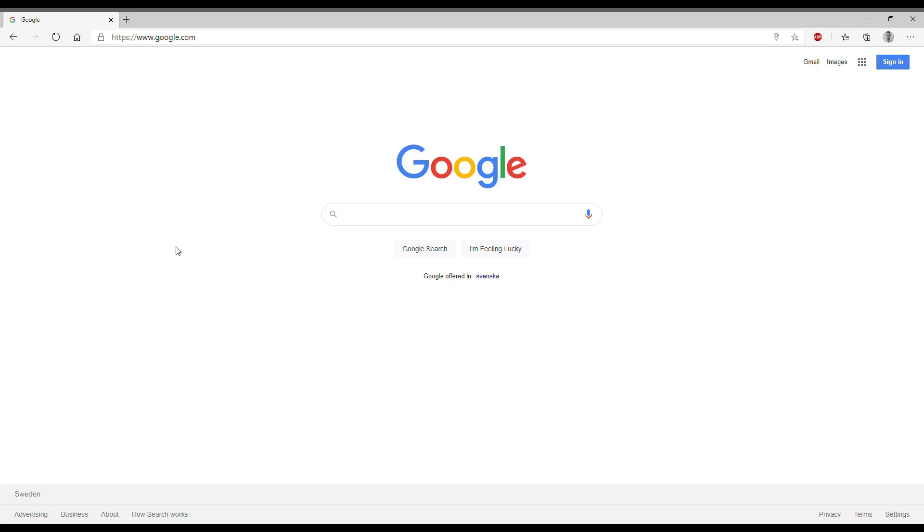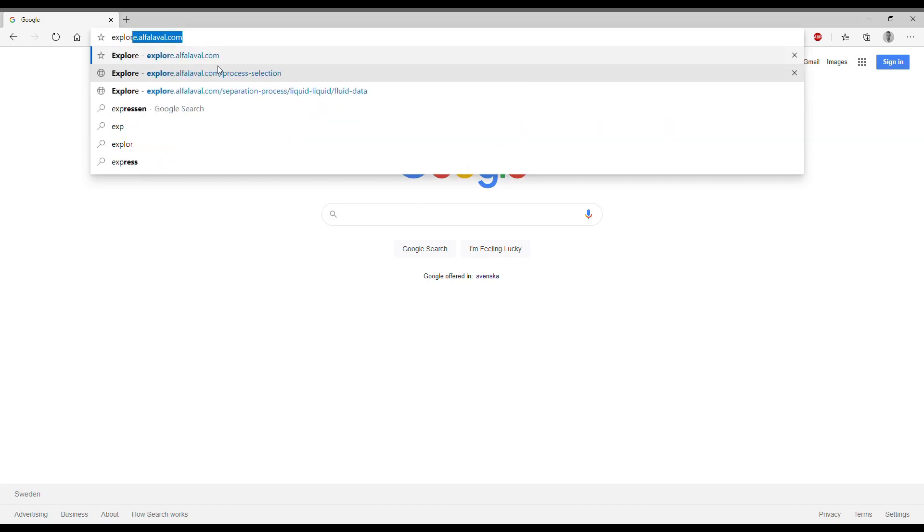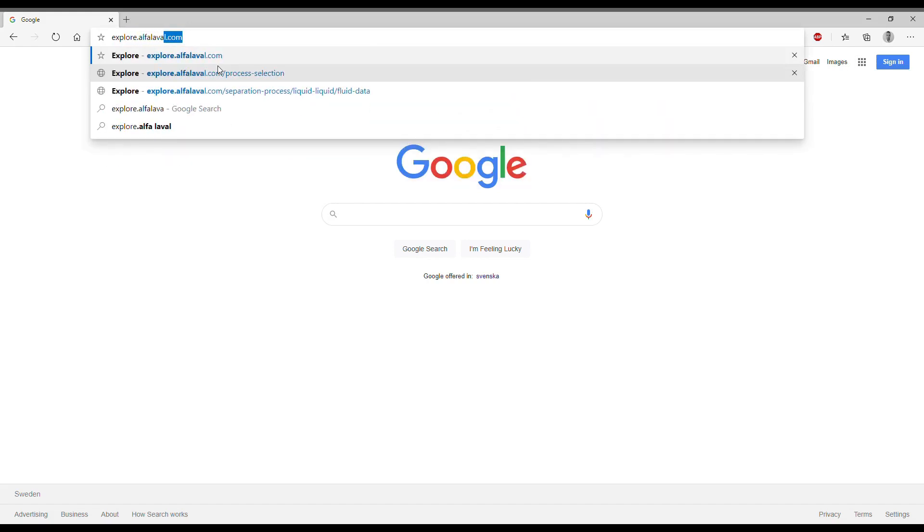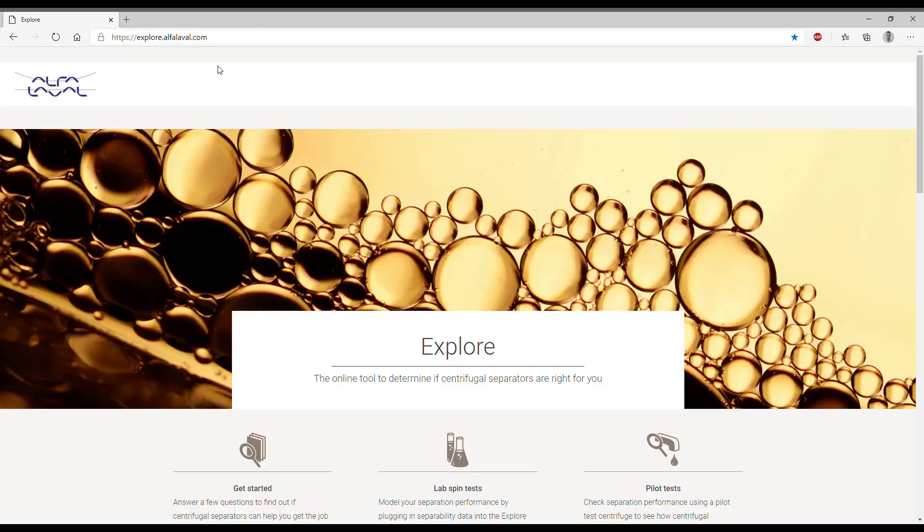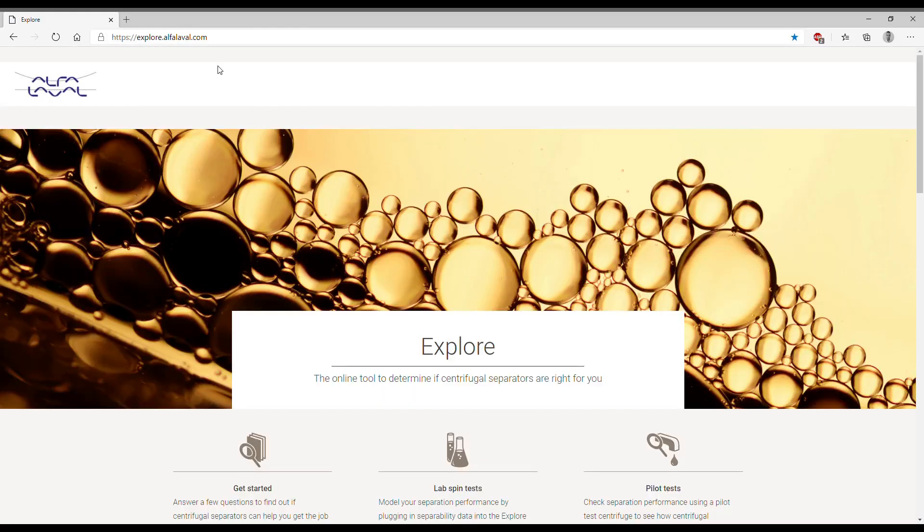We need to start from the home page of our web browser going up into the address bar and type explore.alphalaval.com. When we press enter we reach the home page of our main portal.